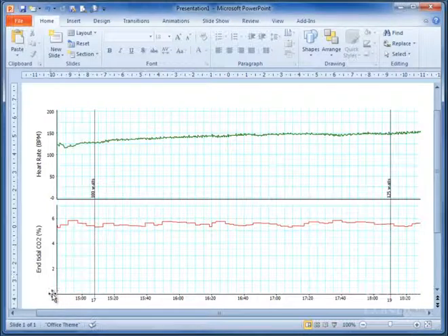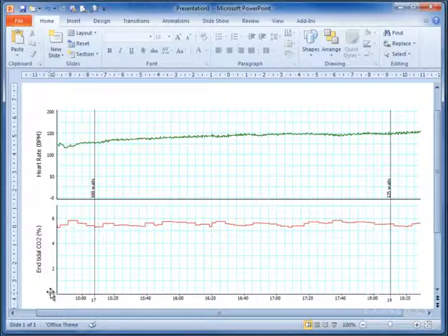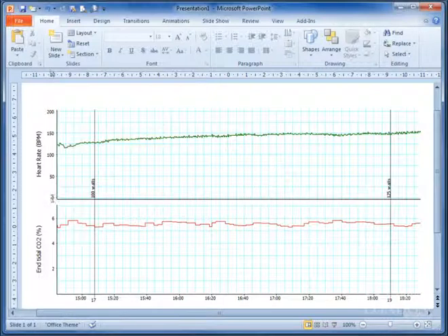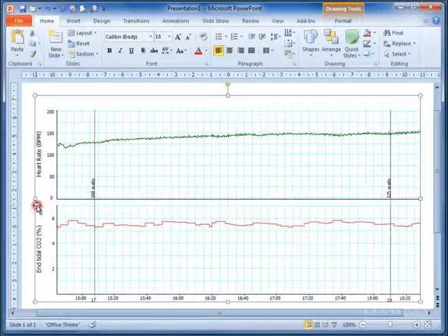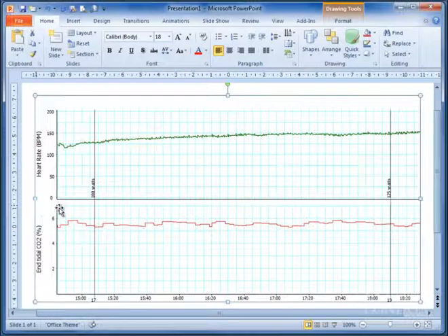We seem to have lost the zero of our end tidal CO2. That's not a problem. We can put one of those in in a second, and we seem to have gained a little negative next to this zero. Of course, you can't have negative zero, so I'll delete that. I'll just leave that as zero. So now this is looking a lot tidier already.